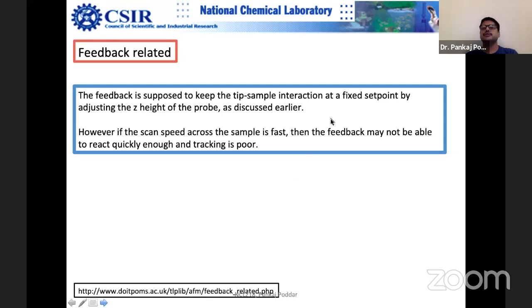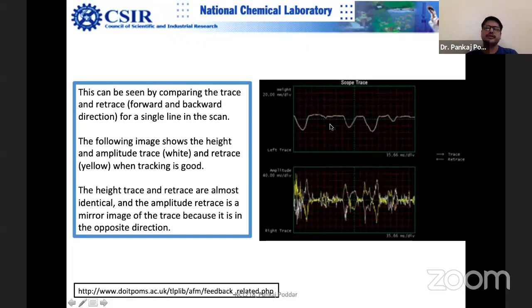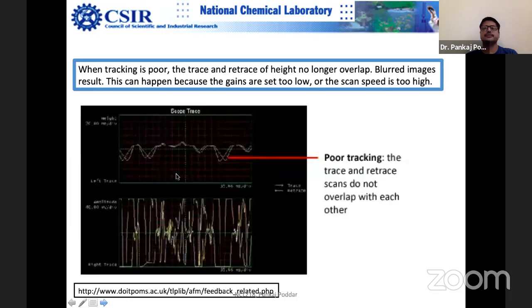The trace and retrace curves in AFM should overlap — if they are clean and matching, only then should you proceed to image capture. Here you can see that trace and retrace are quite identical in one case, but in another case there is clearly a mismatch. Poor tracking means trace and retrace scans do not overlap each other. They should exactly overlap, as happens when scan speed and gain are set correctly.